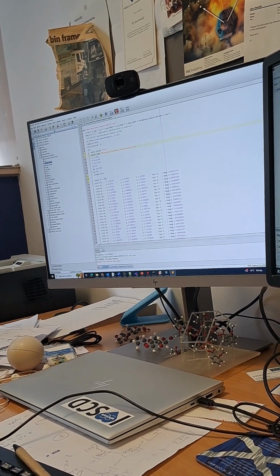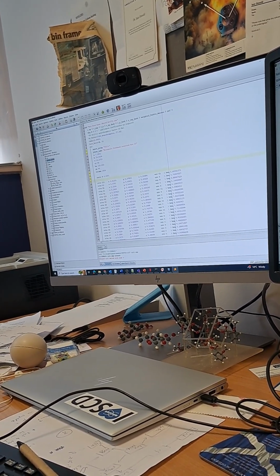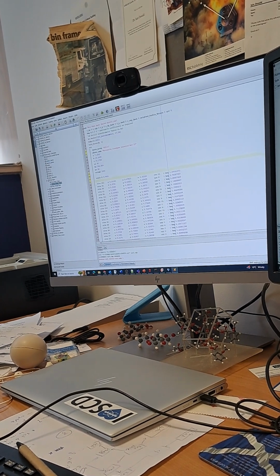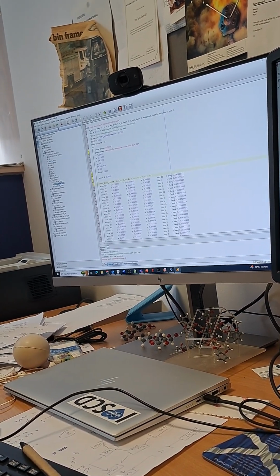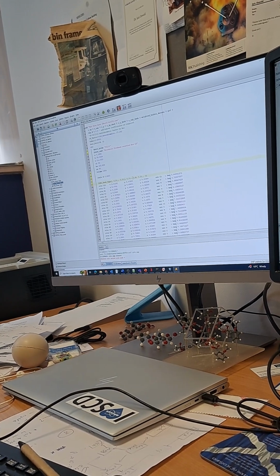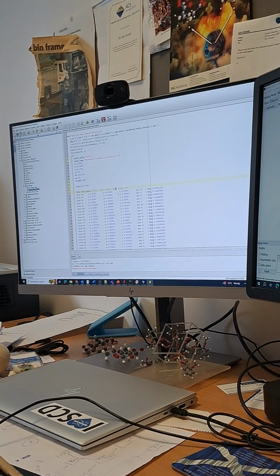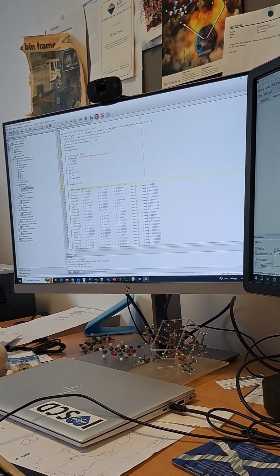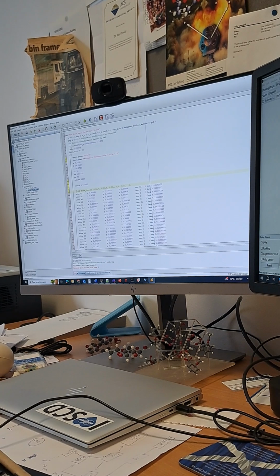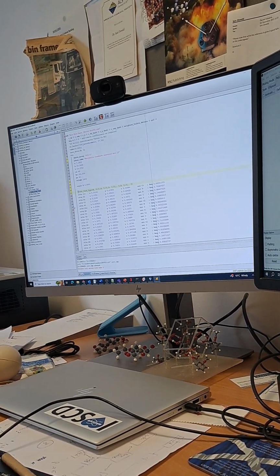Equally, we could start to think about peak type as well. That's the shape of the peak. I think TH said it's fine, we can put that in. We won't do that yet. We don't want to refine any of that yet. We want to just have it there, but I'll put it in and just put a comment here so it's not going to use it. A dash, okay, apostrophe, sorry.